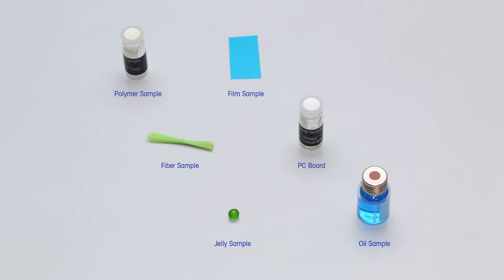Today, we will show TMA sample preparation. For dilatometric and penetration modes, we will use a polymer sample like PET of about 0.5 mm height. For tension mode, we will use a punched-out piece of transparency film and a thin textile fiber. We will demonstrate the use of the three-point bending device on a bar of printed circuit board of 12 mm length. In the swelling tool, we will prepare jelly bears in water, and for volume expansion mode, we will use an oil sample.